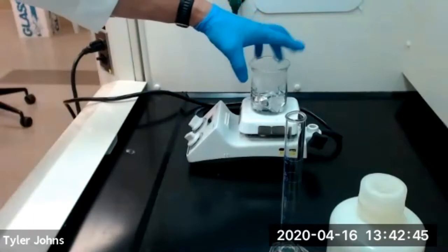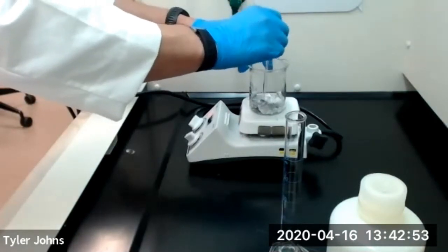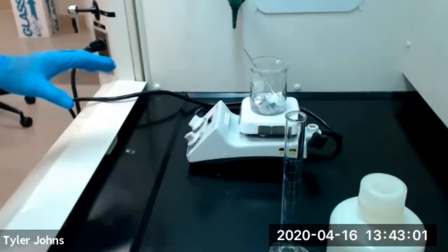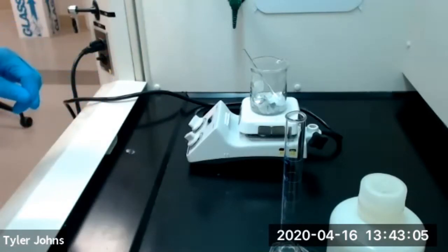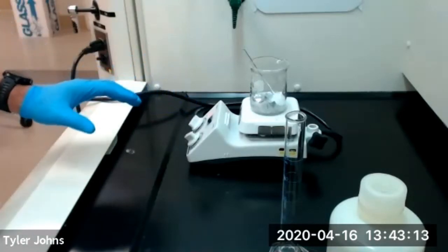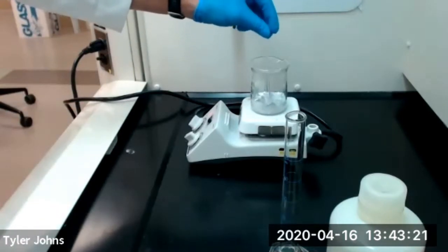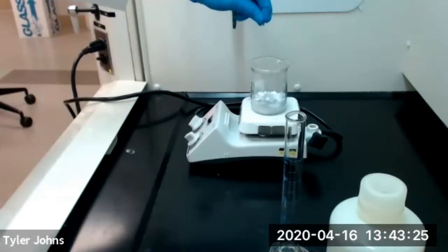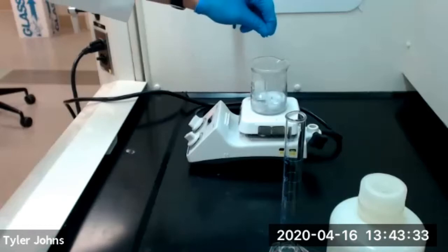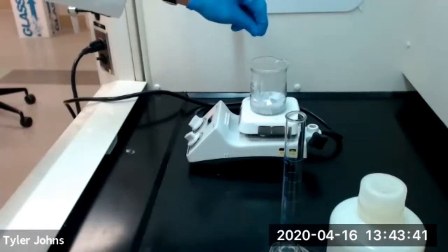We'll heat gently on a hot plate with a glass stir rod. As this heats, it's going to take about 5 to 10 minutes for the aluminum to dissolve except for maybe some small impurities. We will continue heating until the volume has reduced by about 25 to 50 percent. We are getting some fizzing with the potassium hydroxide and the aluminum foil. We do this step in the hood because it's evolving hydrogen gas. We'll continue to let this dissolve until all of the aluminum foil has dissolved in the potassium hydroxide.